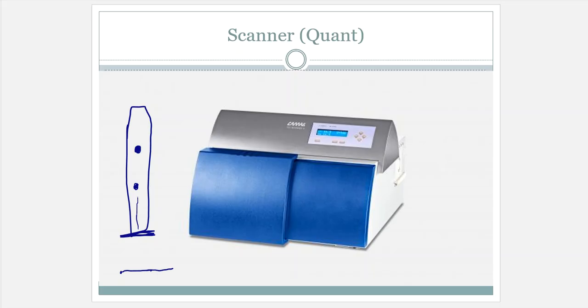And then it gets to an area where it's like, oh gosh, I see something. It's absorbing. I get an absorbance here. And that absorbance is going to make this graph go whoop and then come back down. It's going to come back down because it's going to stay up as it travels over the spot or over the band. And then when it goes back down to nothing, it's going to go back down to baseline, and then it's going to draw flat areas all over again.